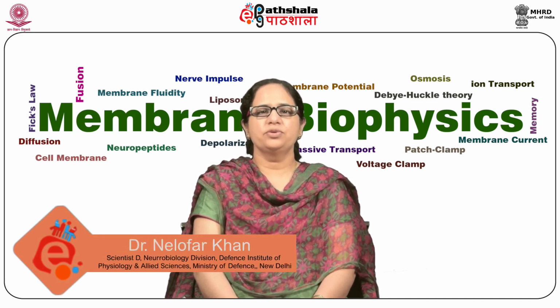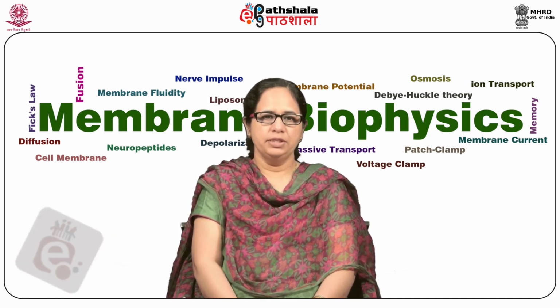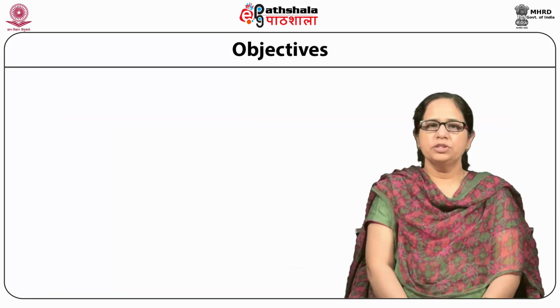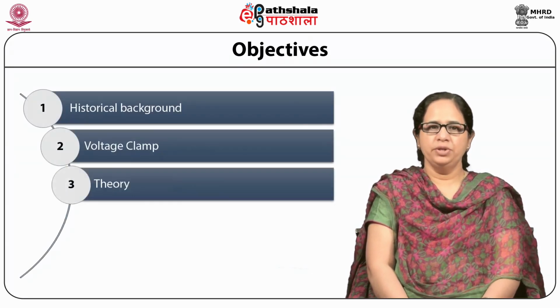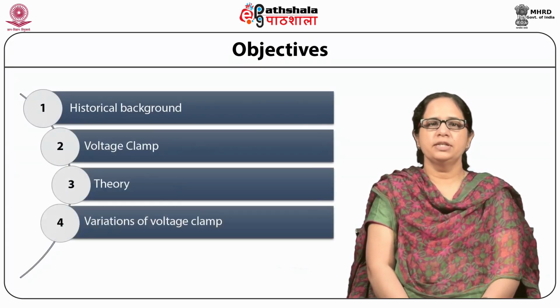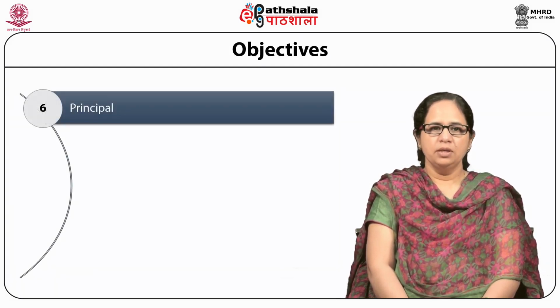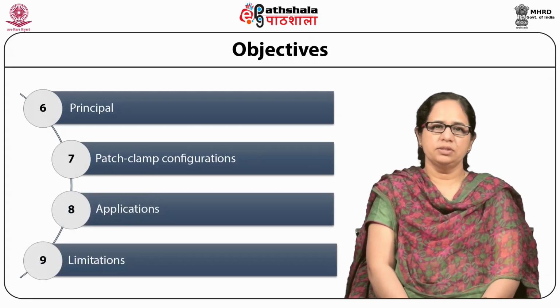Today we are going to talk on the module voltage clamp and patch clamp techniques. This is from the paper Membrane Biophysics. The objectives of the talk are historical background, voltage clamp, its theory, variations of voltage clamp, patch clamp, its principle, patch clamp configurations, its applications and limitations.